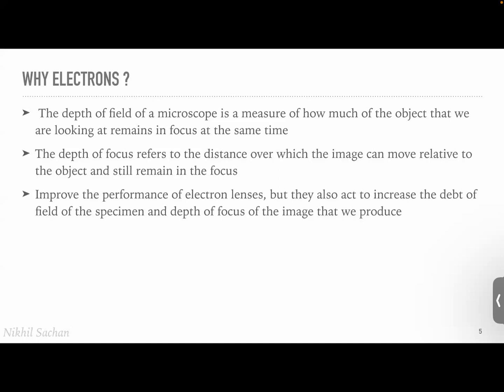That's also one reason. And moreover, we have a particular magnification of our eye. If we compare with optical cameras, a 50 mm lens has the same magnification as our eye. So our eye cannot magnify beyond a particular limit. We always say that if we go beyond 6 or 7 inches, we cannot focus. Similarly, we cannot zoom something beyond a scope. So the visible range is a reason, and another reason is magnification.